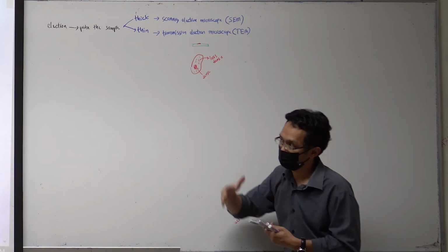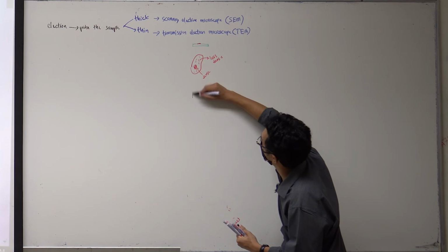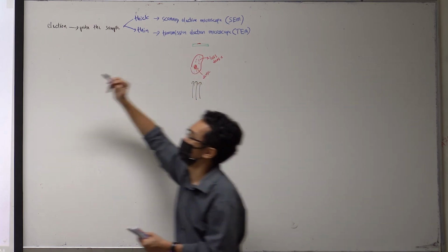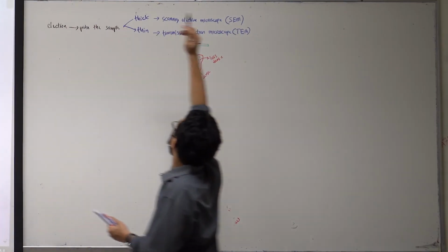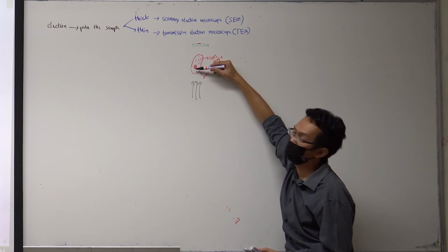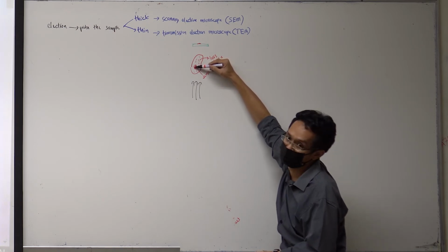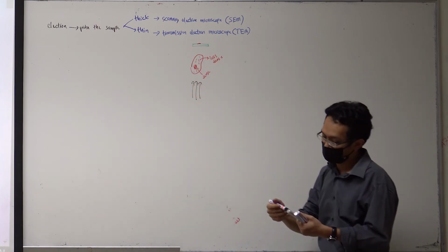The idea of the optical microscope is that light comes from the bottom and illuminates the sample, and the magnification is done by the optics. When light hits dense material, it will not pass through, so you can see the nucleus as darker. You basically create a contrast.